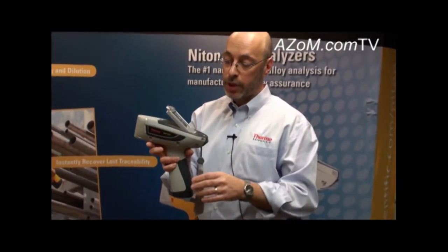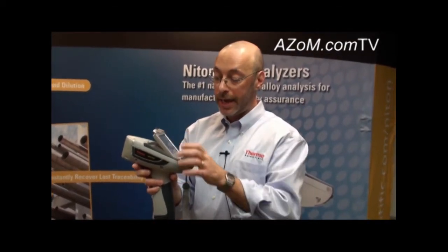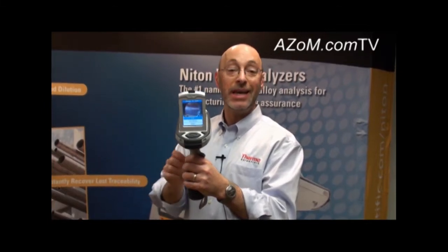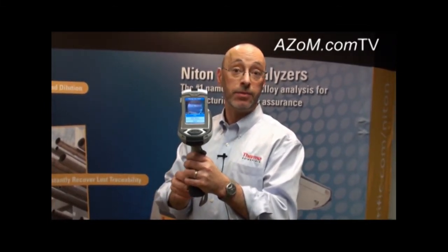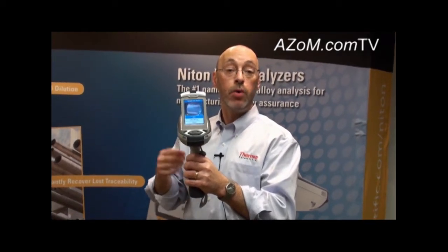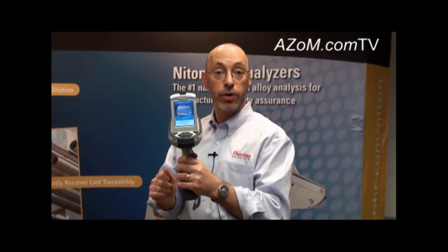The Niton XL3 also has a couple of unique features, including a camera. It has the ability on board to take an image of the sample as it's being measured. When we run some samples a little bit later, we'll be able to see where that adds value in consumer goods measurement and mining applications.